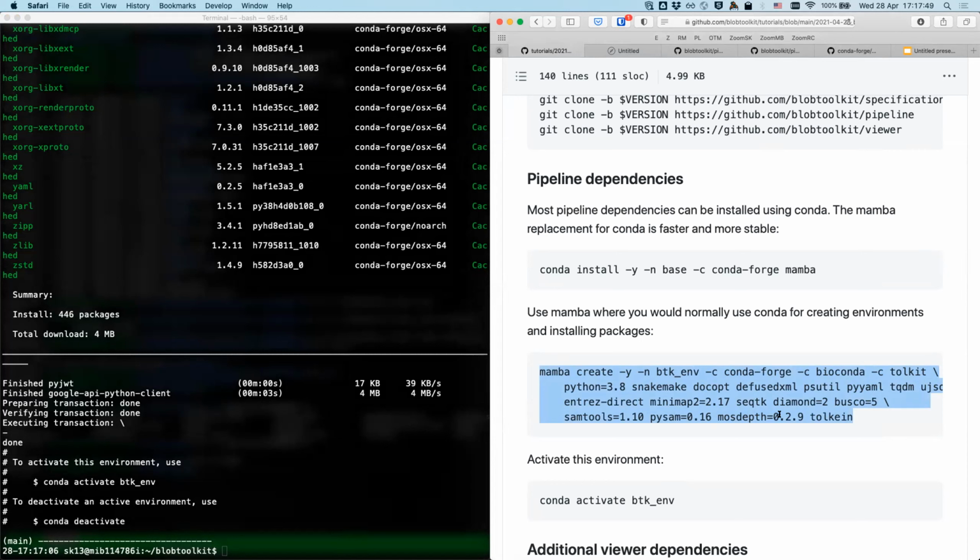Yes, right now the server's in trouble, so I can't run. That's why I'm just watching. Cool. That's absolutely fine. I mean, definitely, I will give this a try for sure. Sure. Thank you. And no, this is a good point, because even if you have a working BlobToolKit environment, it might not work with all the steps of the new pipeline, because of some small changes we've made in the last 1 or 2 weeks. So I know all of this works as of today because I've tested it several times. That's why I was saying do it if you're following along, but that's fine.